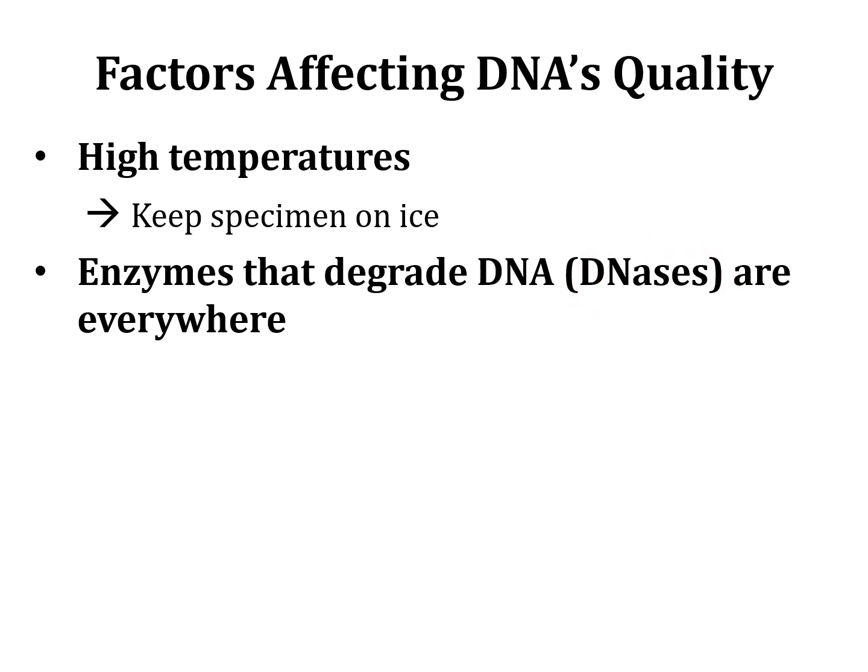As you guys saw earlier, I mentioned proteinase K. Okay, proteinase K is an enzyme that degrades, kills proteins. DNases are enzymes that kill DNA. Okay, they kill DNA, so we have to avoid these DNases. And how to do that? Okay, we can autoclave tools. So our tubes, our glassware, we can put them at high temperature. We can put them in the autoclave machine, which is the type of sterilizer that kills these DNases at high temperatures. Okay, before we use our tubes, before we use our glassware, we autoclave them.